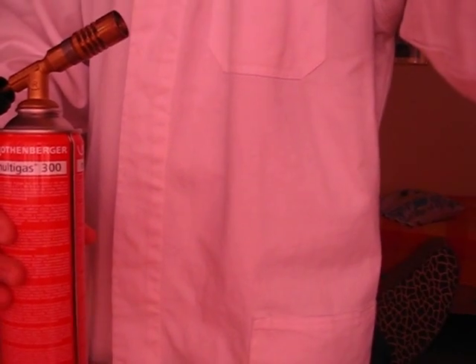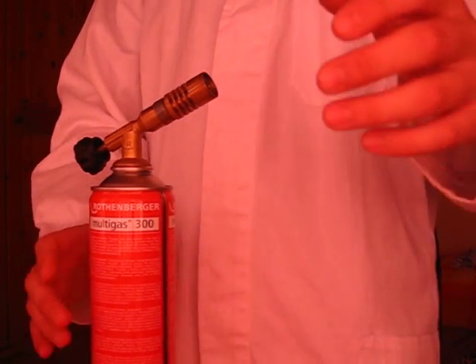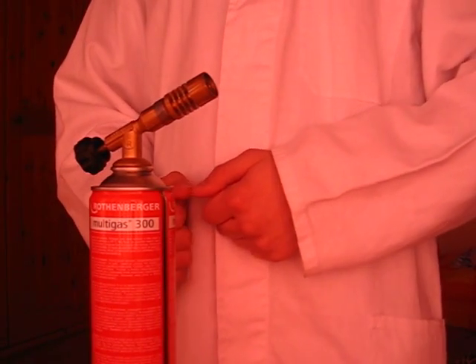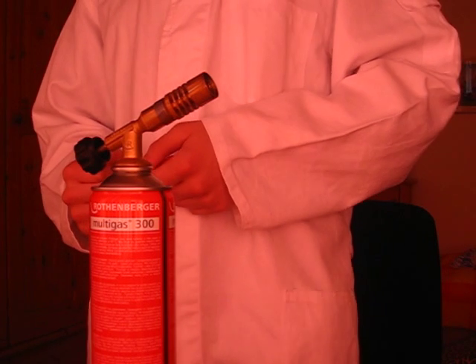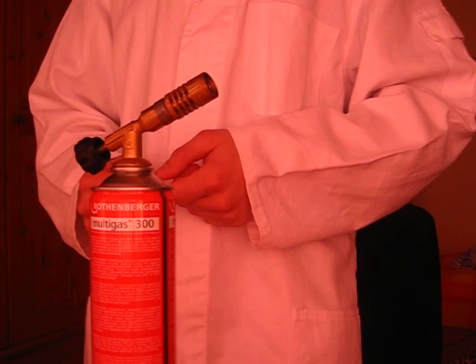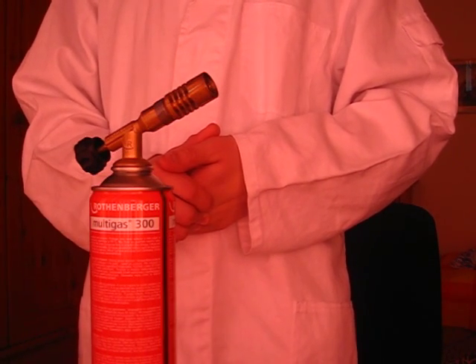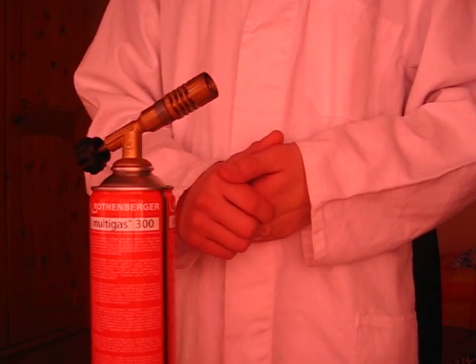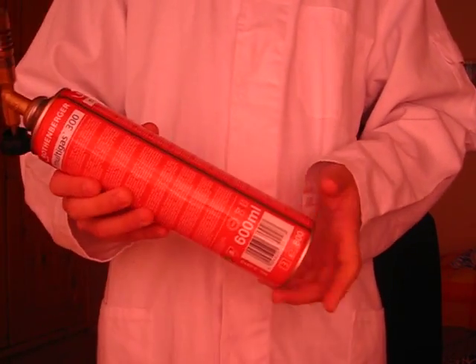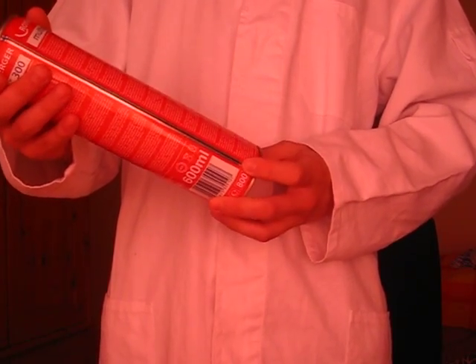So this would be a little demonstration of the Bunsen burner. We all have a Bunsen burner in the lab. Sometimes you use gas that is from the gas tap, and sometimes we use compressed gas, which is in this gas container.